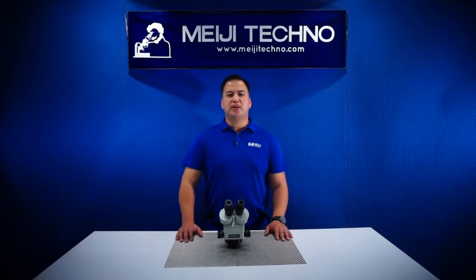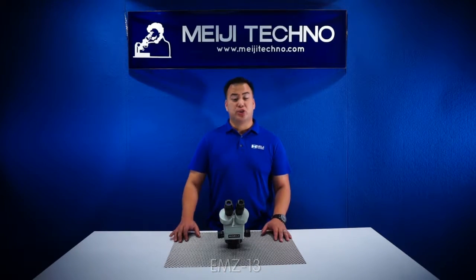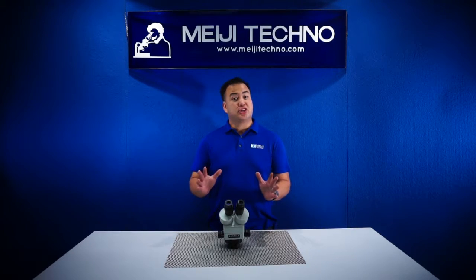Ohayou gozaimasu! Welcome to Meiji Techno. Today we'll be discussing our EMZ-13 model from our EMZ Zoom Stereo Series, which has the highest zoom range in its line.